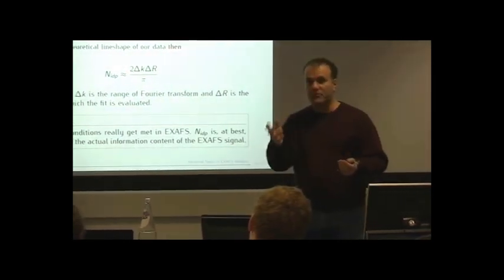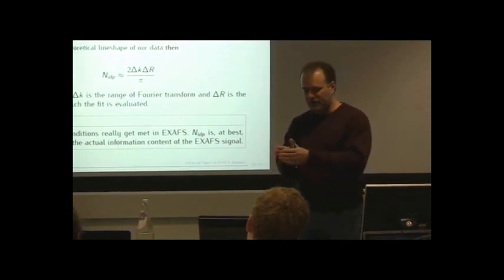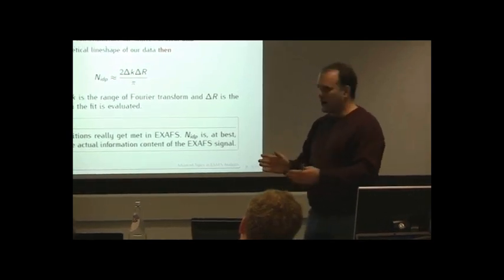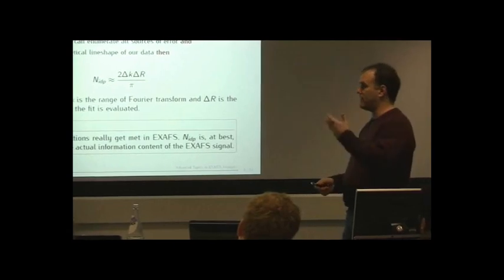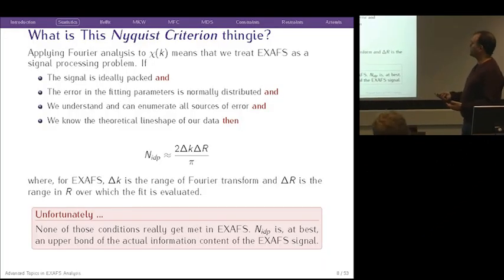It's possible that you might have a sample in liquid contained in a vessel that you know does not have any effective surface tension to change its thickness. But beyond that, none of us really know that our samples are truly homogeneous or don't suffer from any other problem. So we probably don't really know, and we certainly haven't enumerated all the sources of our error.